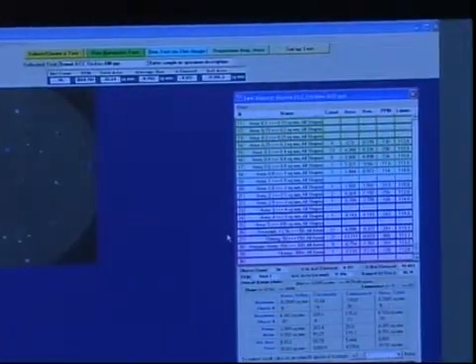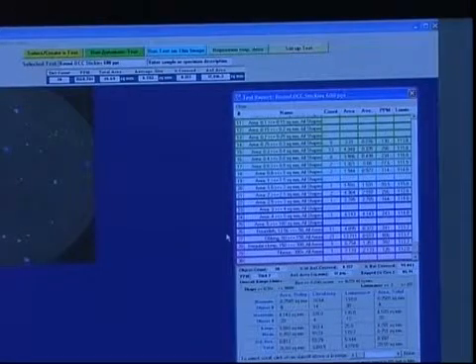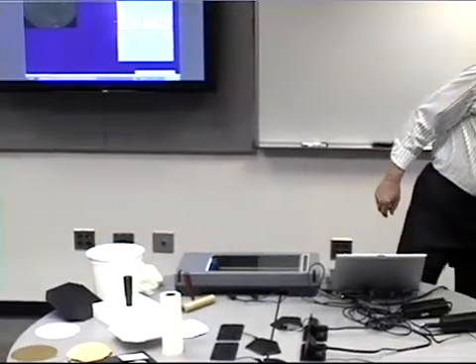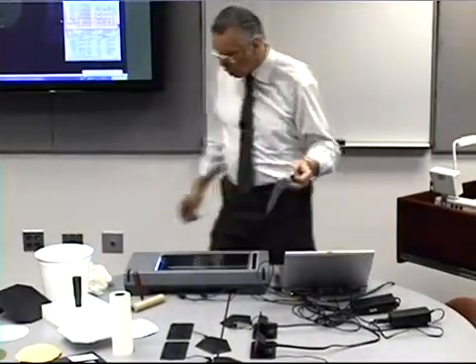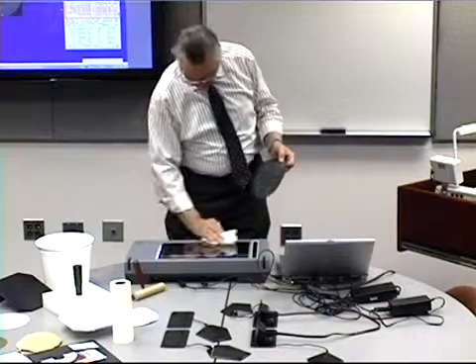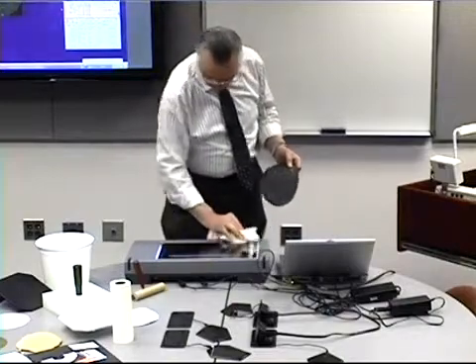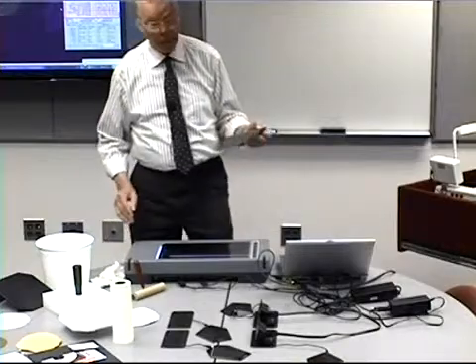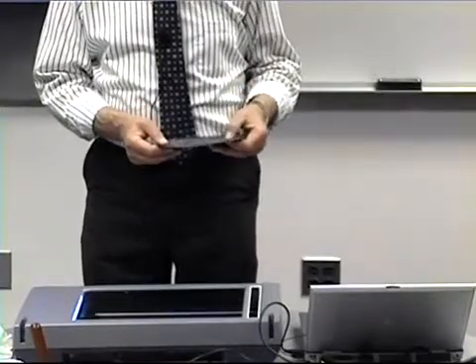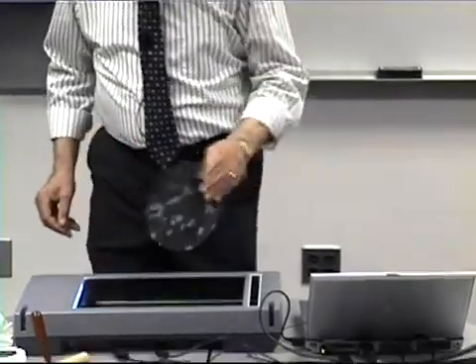Very simple, very straightforward. I want to show you now the method for measuring the black hand sheet from the Polmac device. This hand sheet is a very busy hand sheet. A lot of things going on here. We have fibers present. We have the white stickies, and we have the hairy stickies. And for those who are unfamiliar with hairy stickies, they're the stickies that are stuck to fibers and sometimes cause problems in the process. I can see these hairy stickies, and I will show you an example of them.